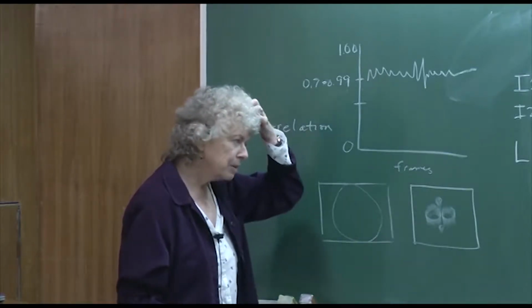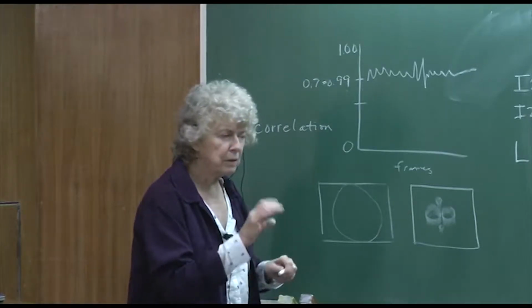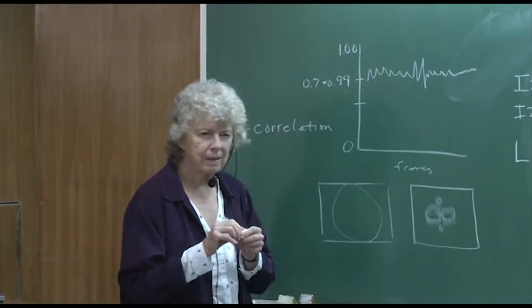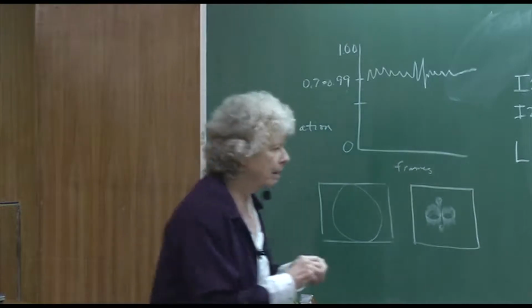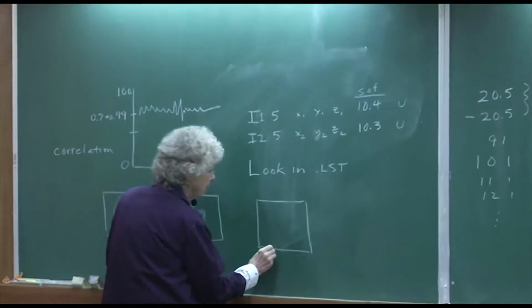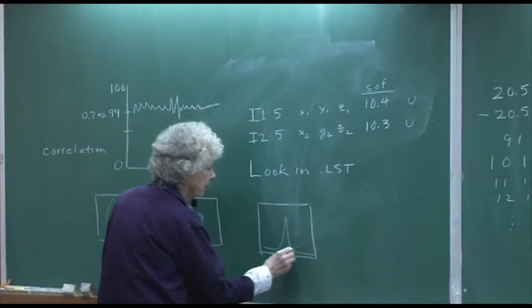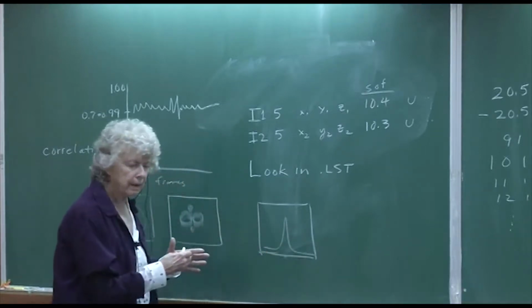And there's another way that you can look at this. On the individual frames, there's a box that you can select, and it does a plot of the peaks. Ideally, it's going to look like something like this, with a pretty narrow peak width.